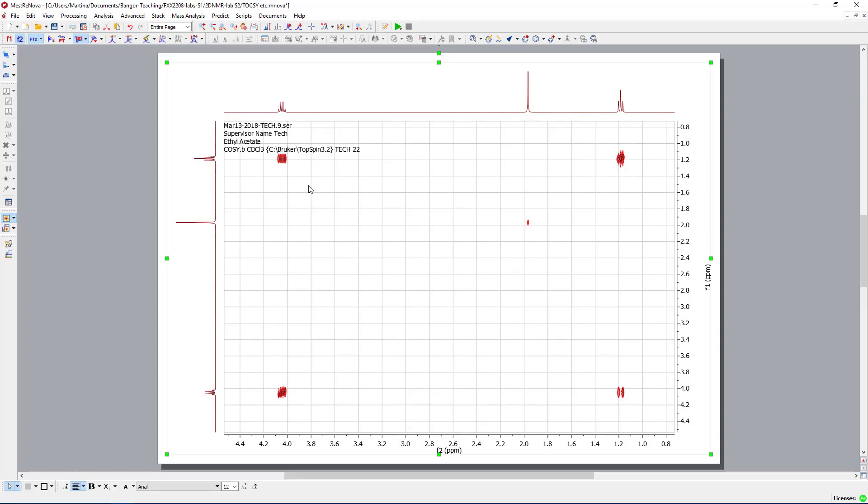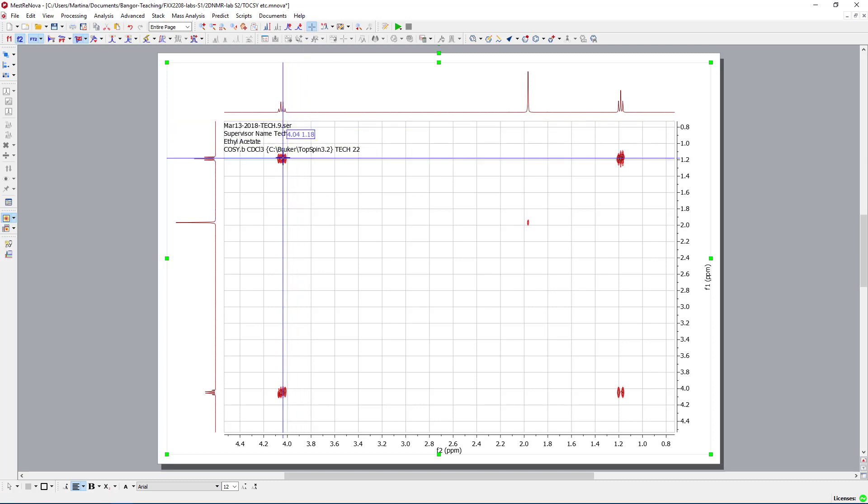And if we look for any additional peaks, then we see extremely little. The only thing we can see is that the two carbon atoms, or the two groups that are belonging to the ethyl alcohol, from the ethyl acetate, are coupling with each other. And that's what's expected.